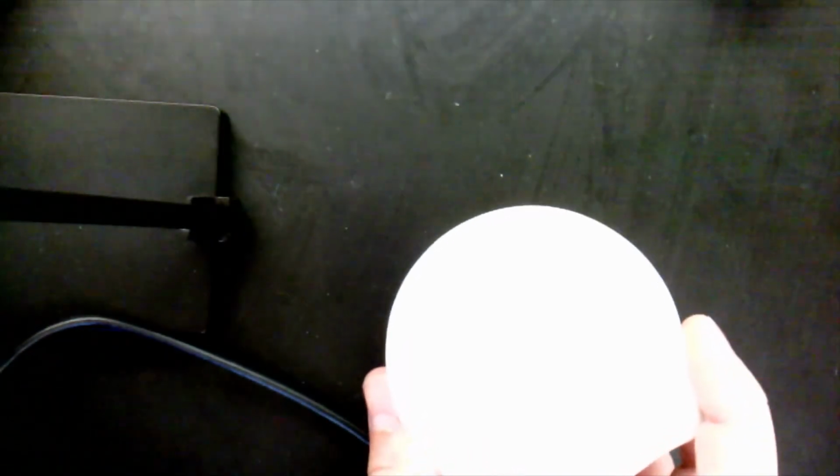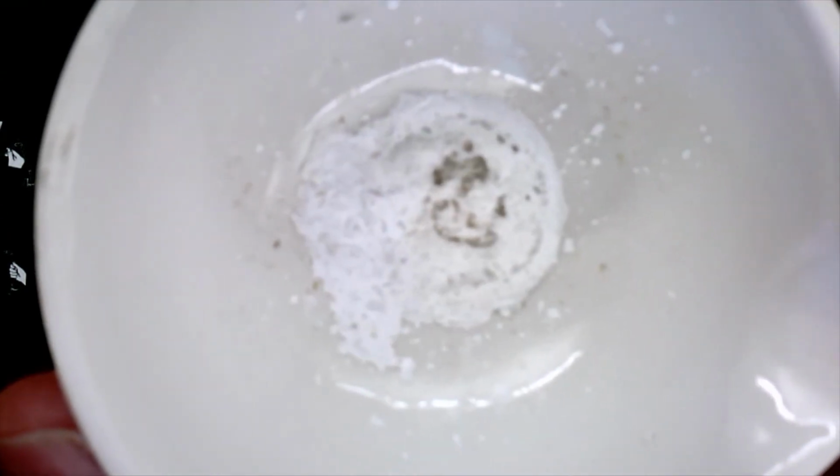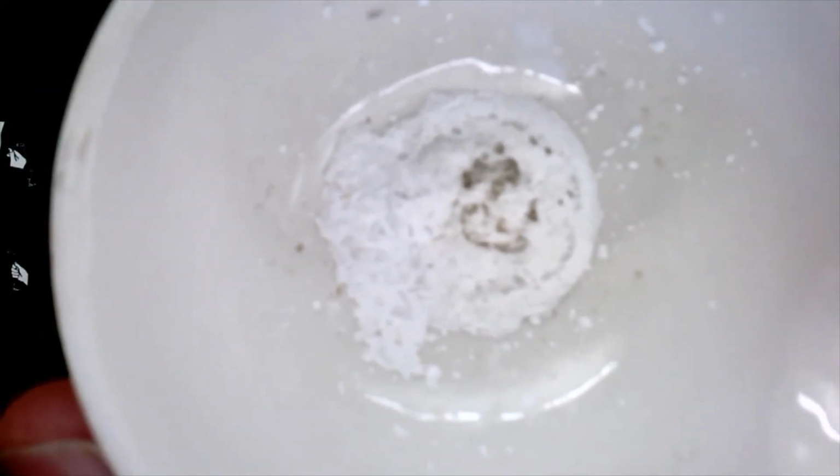Our magnesium has finished reacting with hydrochloric acid. And once again, it's impossible to tell what I have here. There we go. That's much better. Okay, magnesium has totally reacted with the hydrochloric acid, and all I have left behind now is this white powder with some little flecks of gray in it. Actually, there's just a few tiny flecks of gray. Most of what you're seeing from this shot is a shadow. That really dark coil-looking thing in the middle is just a shadow. There's nothing there. So I just get a bunch of white powder now that all my solvent is gone.